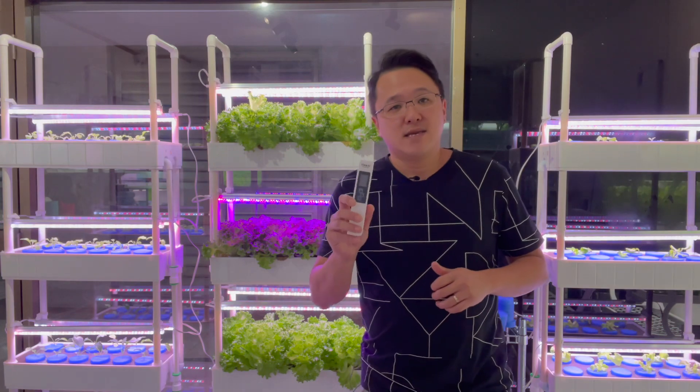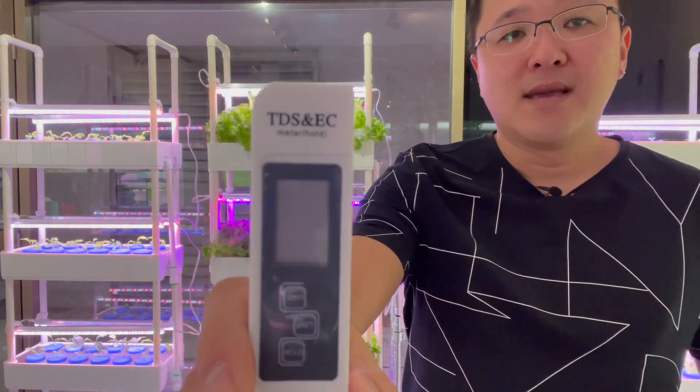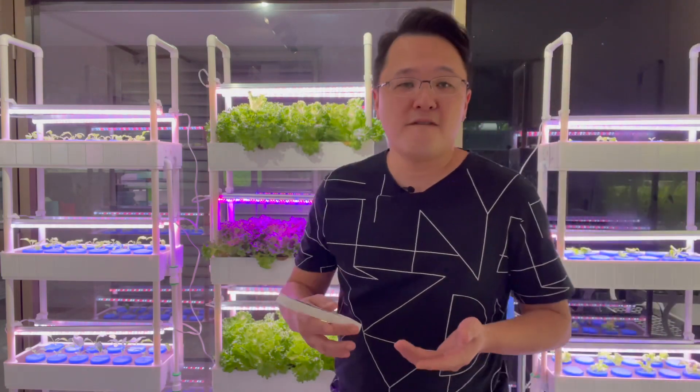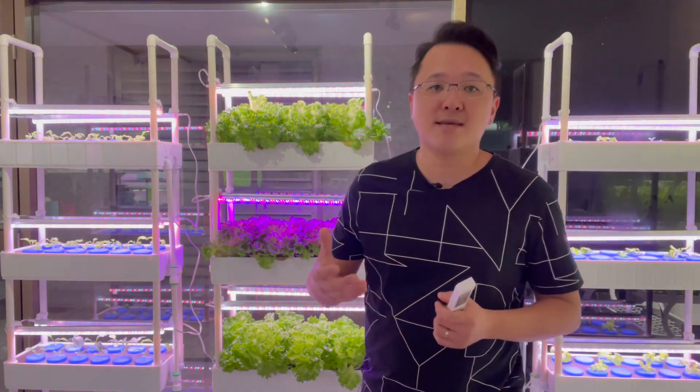So, what is TDS and what is EC? It's called the TDS and EC meter. TDS is total dissolved solids, and it's measured in a unit called PPM — parts per million.